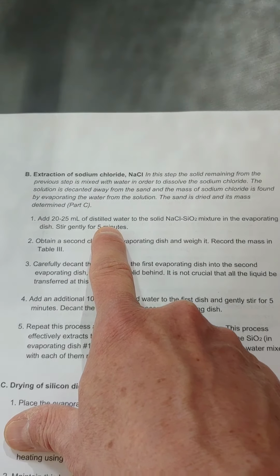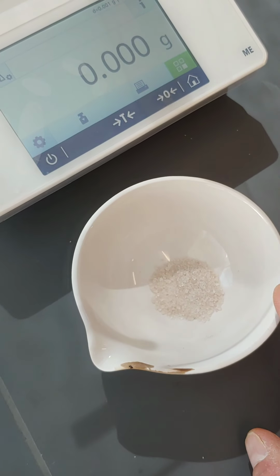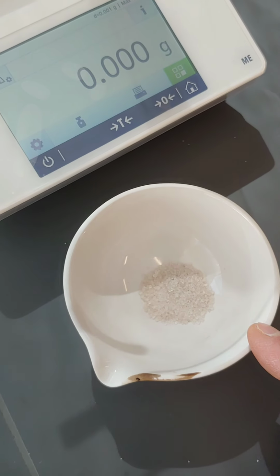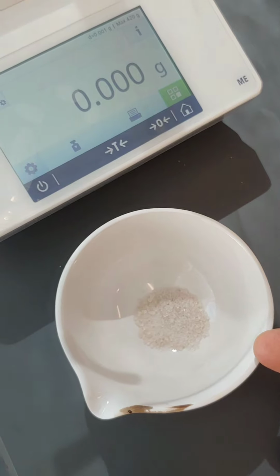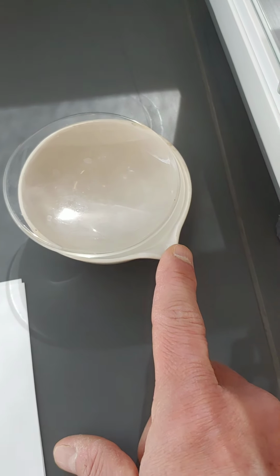I just want pure water. I'm going to add about 20 to 25 mils of water to that, stir it for about 5 minutes, and then obtain a second clean, dry evaporating dish, which I have right here. And after I've taken this sample, added the water to it, and stirred it up, all the salt is going to dissolve in the water. I'm going to pour that water into this second dish.